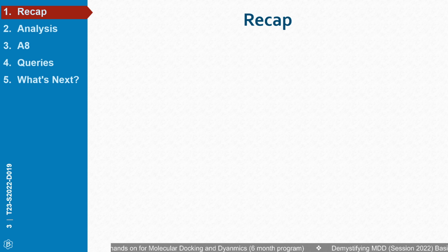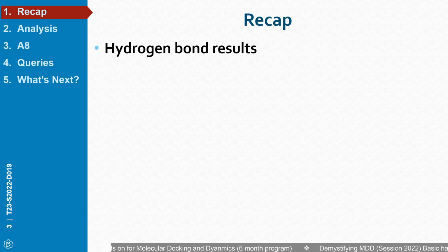Last session we covered hydrogen bonds, and you have seen that you can also save the information in a separate file. There were two options: you can go through the command line, and also through the ViewDockX, which is a built-in tool for docking analysis in ChimeraX.